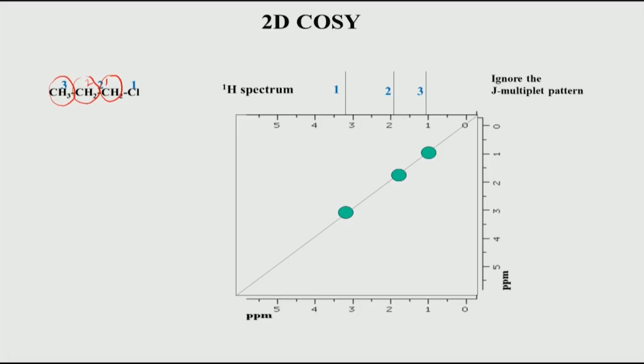There have been a lot of papers published where scientists have tried to get rid of this diagonal, but remember it is not very easy, because this behaves like its magnetization. You cannot distinguish in NMR between what remains on itself and what is transferred to somebody else, both of them look the same. So, how do I selectively suppress or remove the diagonal, but keep the transfer information? That is called the cross peak.